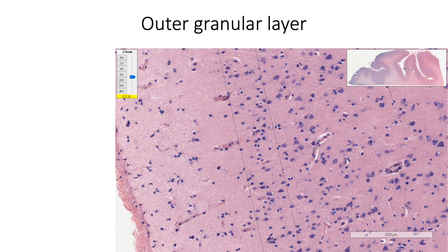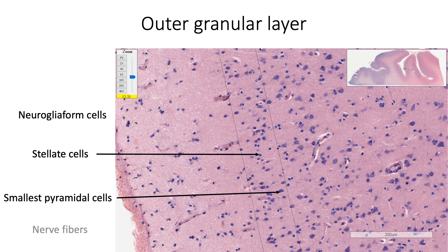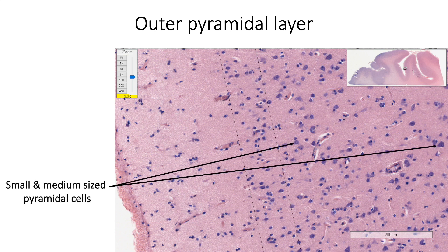The second layer is the outer granular layer. In this layer we find stellate cells, the smallest pyramidal cells, a few neuroglioform cells, and nerve fibers. The third layer, or the outer pyramidal layer, consists of small and medium-sized pyramidal cells, along with a few fusiform and basket cells.